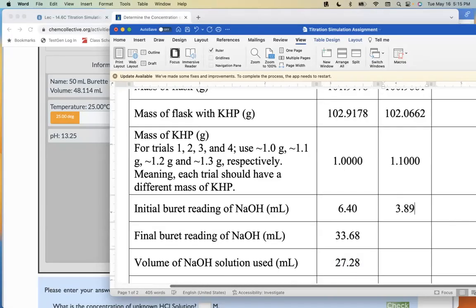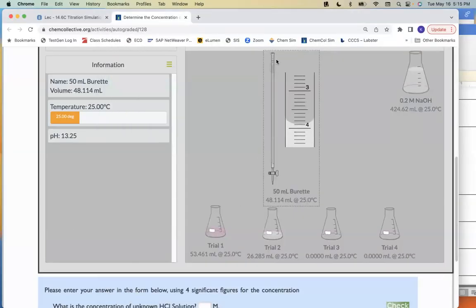You may fill it to any quantity that you want, and then you can start there. Just make sure your burette is full again. And you can tell that it's full if there's a box on the very, very top, and the zoomed in image has markings that are really small, close to 0. So anywhere between 0 and 10, and your burette is roughly full.